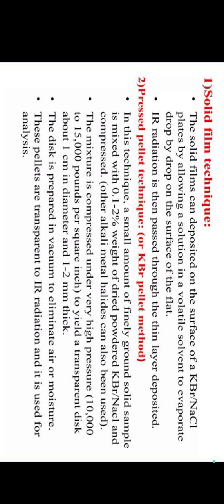Second one, the pressed pellet technique. It is also known as the potassium bromide pellet method. In this technique, a small amount of finely ground solid sample is mixed with 0.1 to 2% by weight of dried powdered potassium bromide or NaCl and compressed.